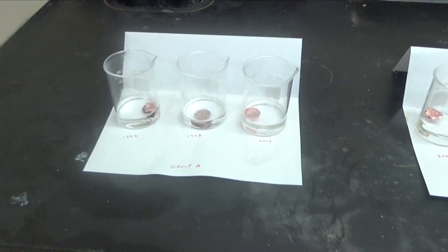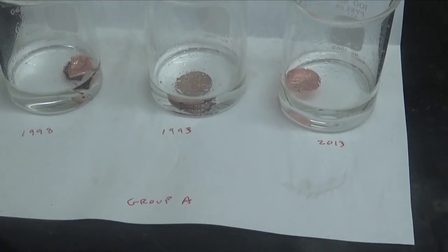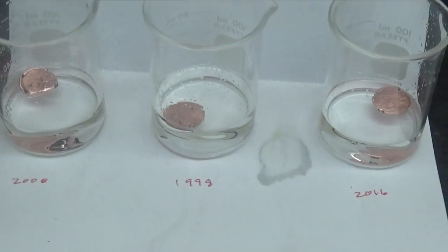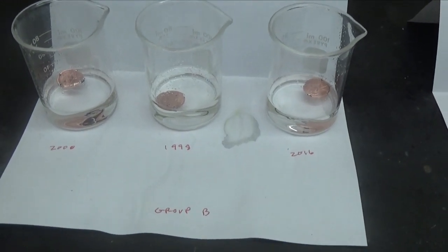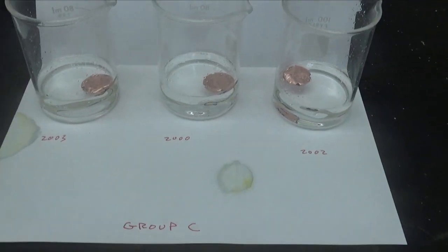It's been about 24 hours, and notice that for group A, there is one penny in the middle that's not floating. That means there may be some residual zinc. We'll have to test that. All of the ones from group B are floating. That's a good sign. And all of those from group C are also floating.